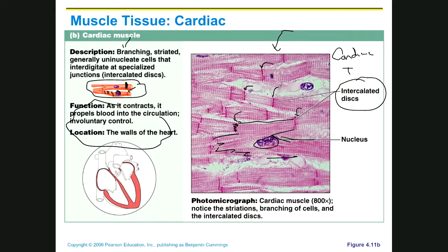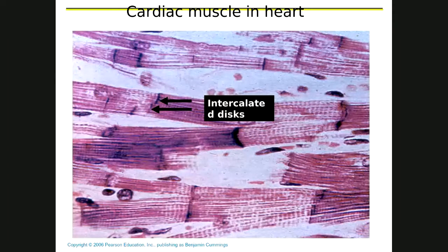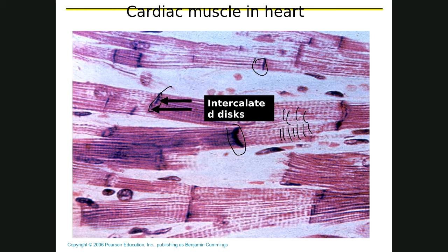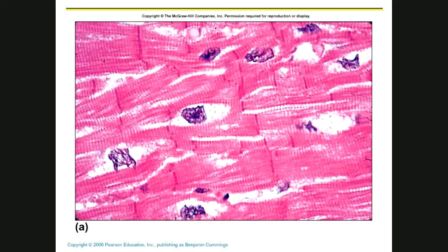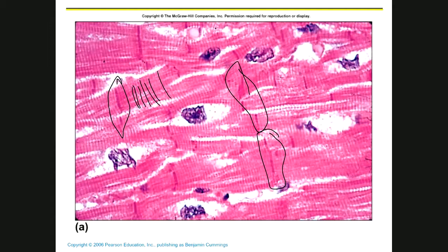Remember, cardiac muscle is involuntary. This picture shows the intercalated disc very, very well. Even though it's hard to see, you can see the stripes in here. Can everybody find the intercalated discs? Can everybody see the stripes? So it's striated tissue — the stripes are not as obvious as they were with skeletal muscle, but they're there. There's the nucleus. So, cardiac muscle.